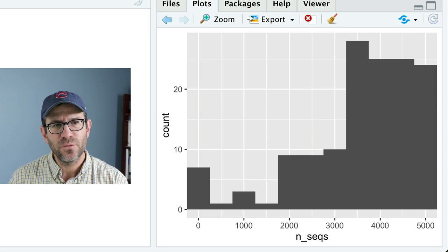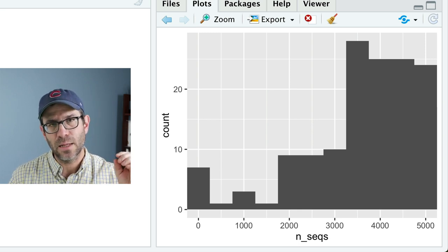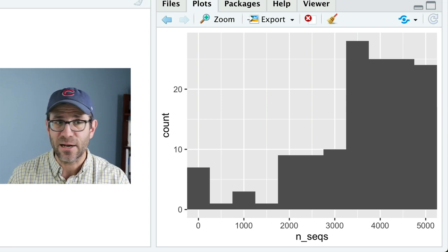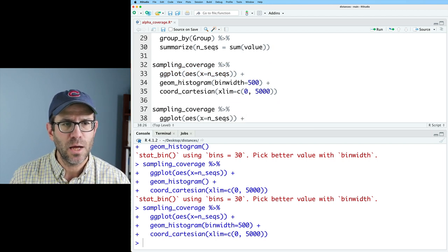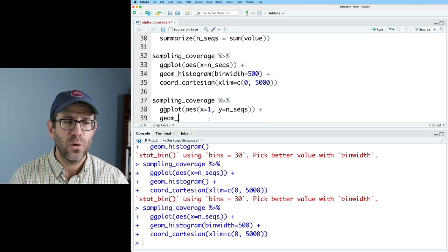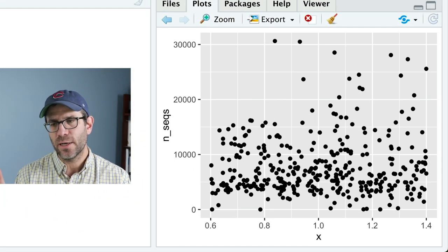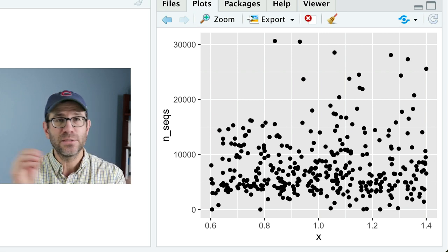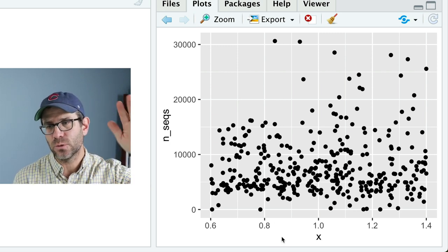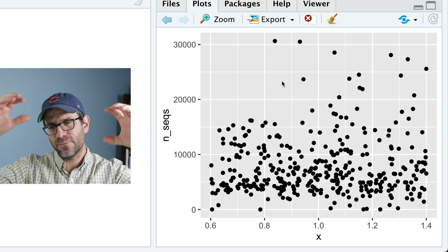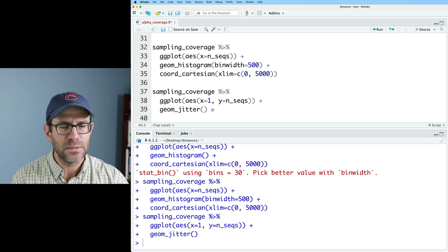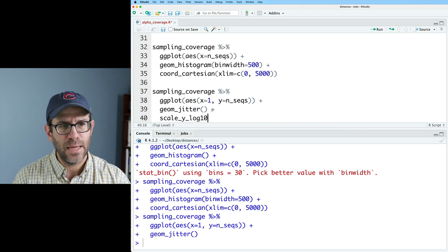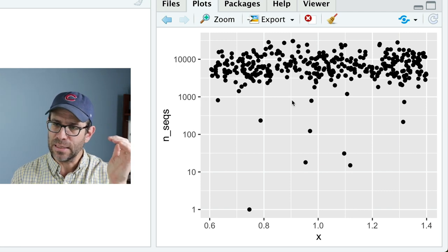So let's move from there and looking at the distribution of the density of the number of sequences to thinking about things, perhaps looking at individual samples as points in something like a scatter plot. So what I'll do is I'll go ahead and grab these lines of my sampling coverage and my ggplot. And on the x-axis, I'm going to put the value one. And on the y-axis, I'm going to put nseqs. And then I'll go ahead and do geom jitter. And so what this has done is this has created a jittered plot. And so basically the position on the x-axis is randomized, so the points don't overlap each other so much. And then the y-axis is the actual number of sequences.